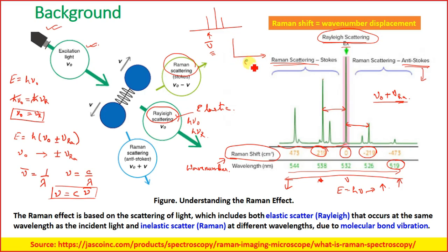concentration versus intensity, using a known sample. So you will get something like this. Then when we analyze the unknown, you will get some intensity over here. Now from here you just put in the value of intensity.